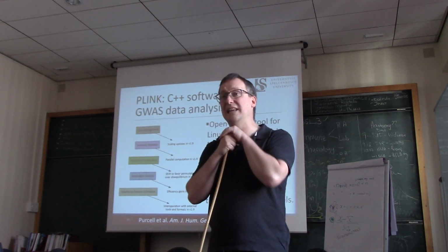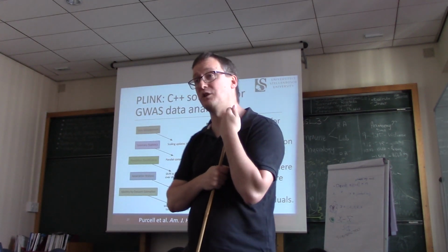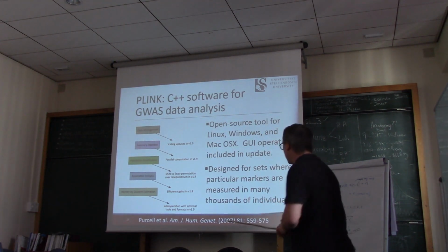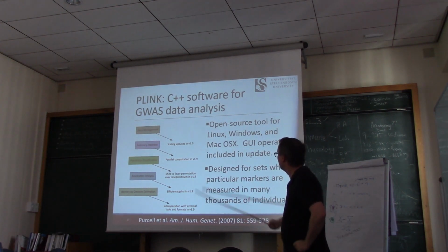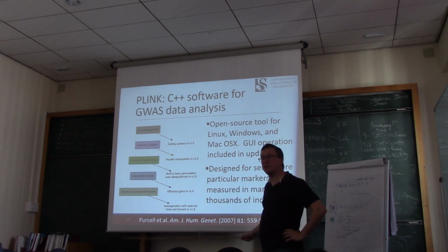Okay, PLINK is some software that is very, very widely used for GWAS data analysis. I've included a link to it down here. In the most recent versions, they've done a lot of changes to data management. You see, scaling is a really big issue.